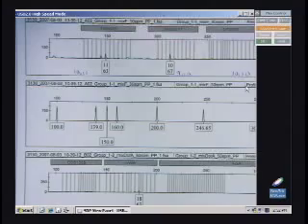Is that what you wanted? To get an idea of your internal length standard, it's about 1,000? Yeah. So it is tenfold higher than... My suspicion is it's the 3130 instrument. You think it's the sensitivity of the instrument? Yeah, that's part of it.